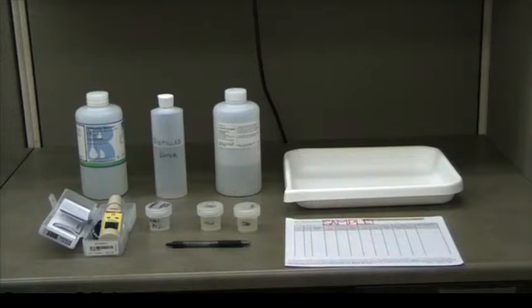Before going into the field to take measurements of specific conductance, you must first calibrate the EC tester.